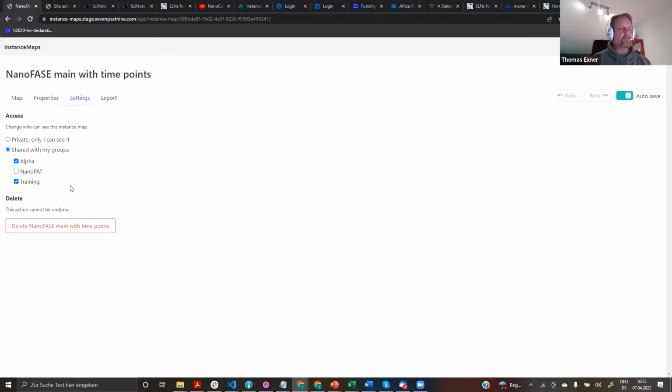Therefore you can be in multiple groups and share with multiple groups, but be careful that everyone sees that. Be aware of whether you really know who these people are. If you need to know who they are, I can share that, more or less. It's personal data, therefore it's a little bit problematic.